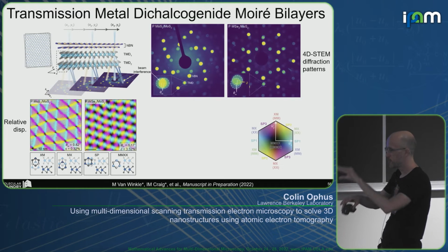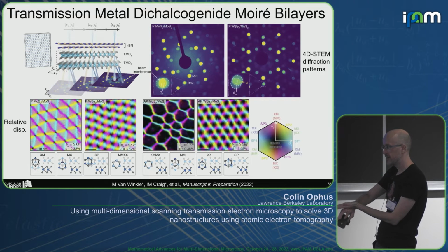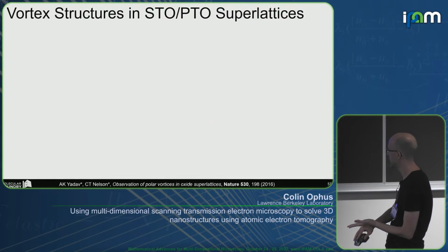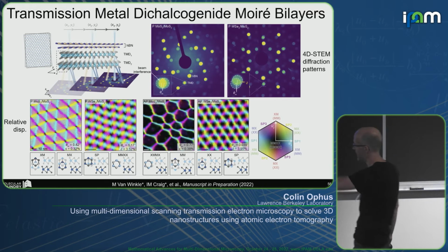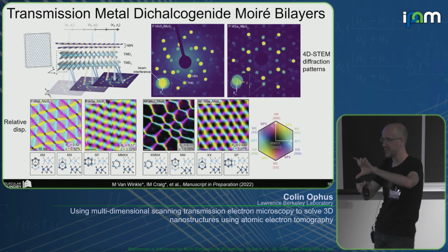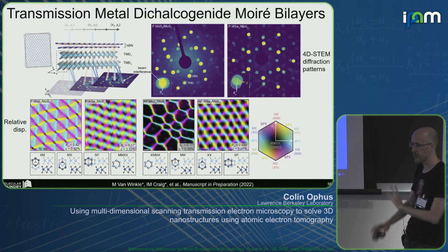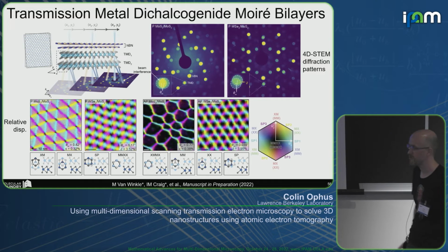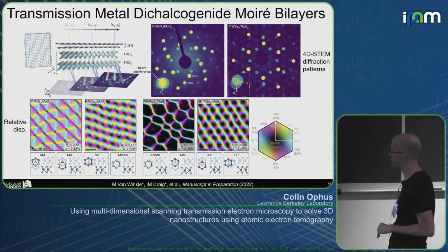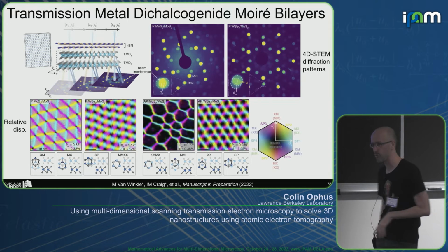But what happens if you pick up the material, flip it upside down, and put it back down? Now you have an anti-parallel orientation. This is where you are going from, say, AB stacking, or ABA, on top of ACA type of stacking. And you get a completely different relaxation mode here. The reconstruction field is very, very different. And I didn't have time to talk about the twisted bilayer graphene. Definitely don't have time to talk about this thing. This is a very, very detailed study here that we're about to submit.